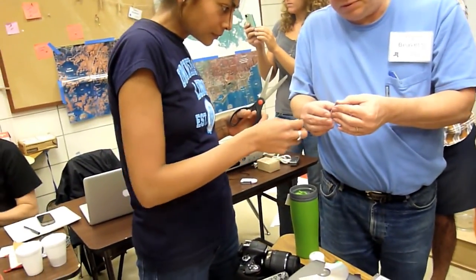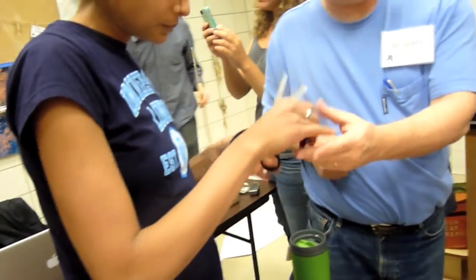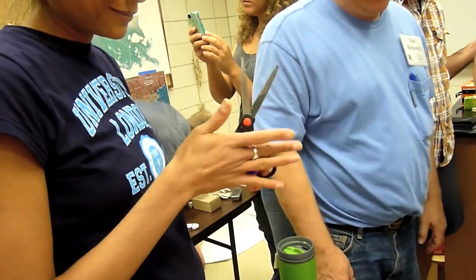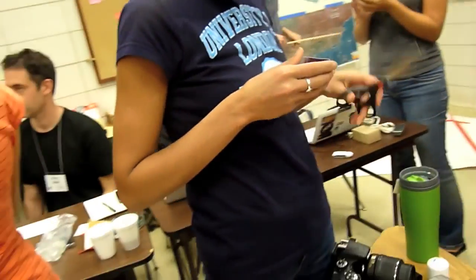In between our light source ranges. Right now we're more limited by the camera over there, and this is the collection container. Where would you say 700 nanometers is? Where's the end of visible? This is what we've got to do. It's probably right about here.